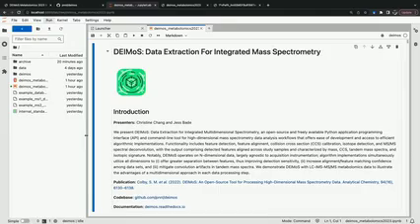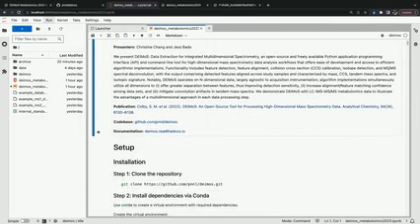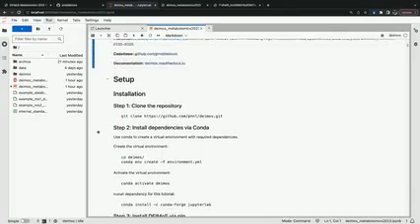And so we're hoping that this opens up DEIMoS for future instrument development and makes this future-proof or friendlier towards advancements in mass spec technologies. And so we've included in our notebook links to the publication for DEIMoS.